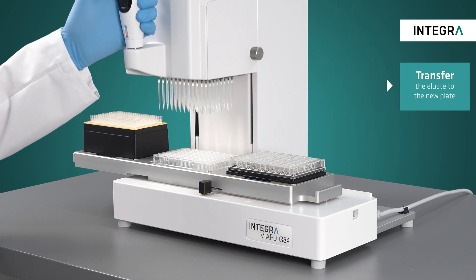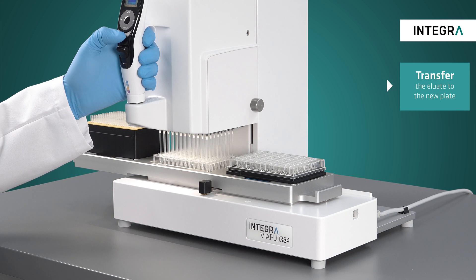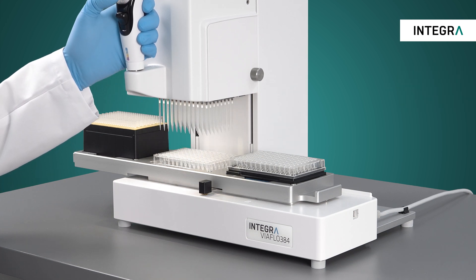The eluate is dispensed into the target elution plate. Now we are finished — 96 samples of purified DNA ready for further processing.